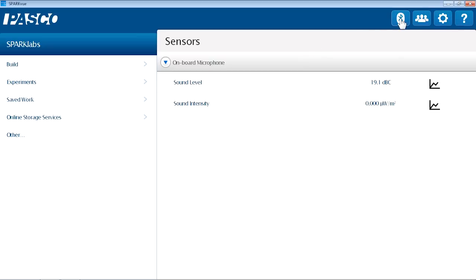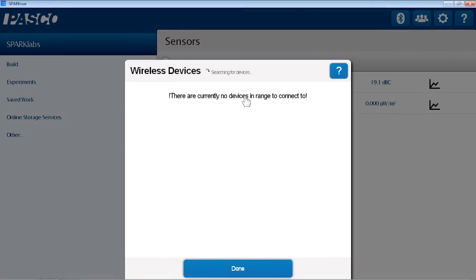So in my software, I can touch the Bluetooth icon. And I will see which devices are broadcasting that signal. And I can see based on measurement, through using these icons, that there's a pressure, a temperature, and a pH.